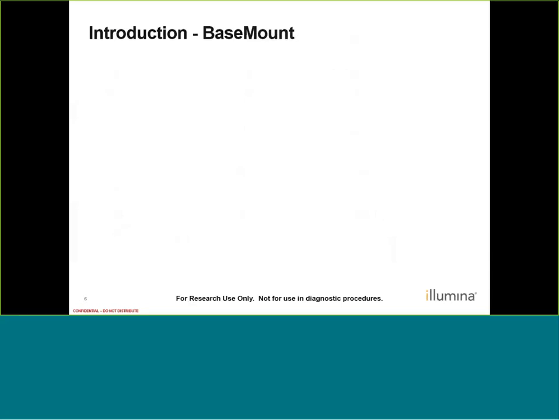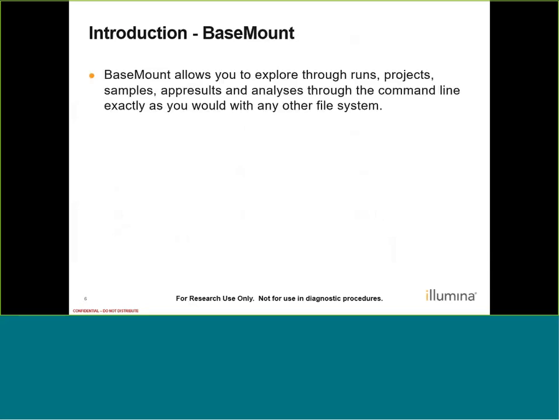Now let's provide a quick overview of BaseMount. BaseMount allows you to explore runs, projects, samples, app results, and analyses through the command line exactly as you would with any other file system. You're likely already familiar with runs and projects in your BaseSpace account. But within a project, we have samples, app results, and analyses. BaseMount allows you to interact with those entities just like you would with directories and subdirectories in a file system.